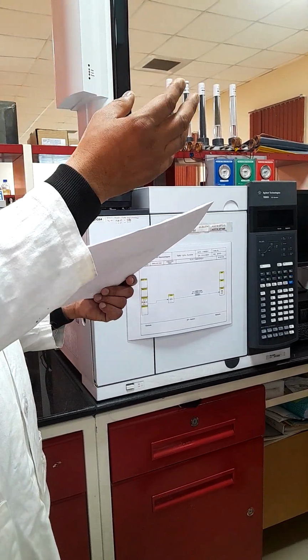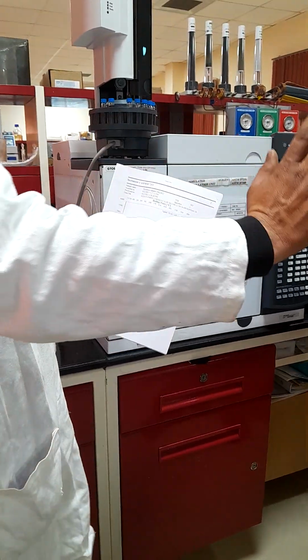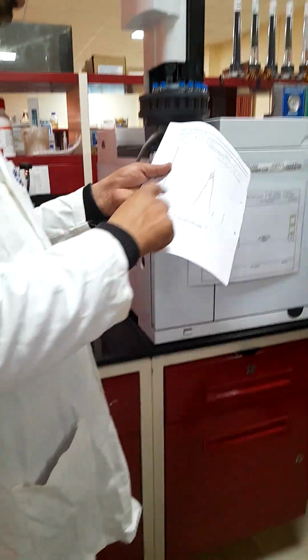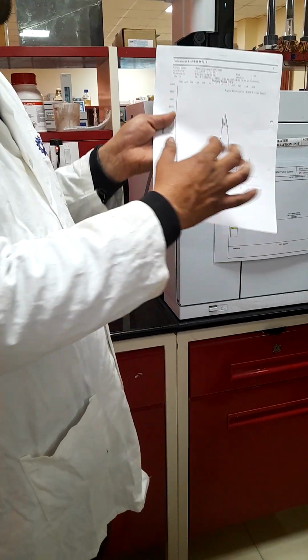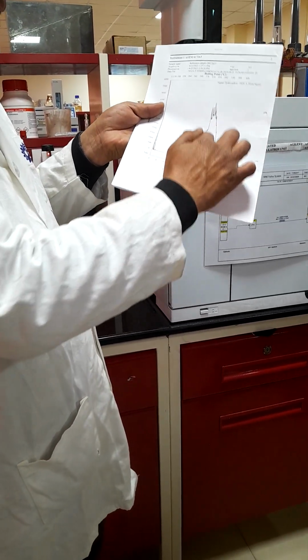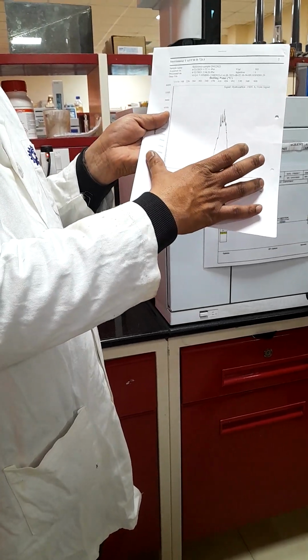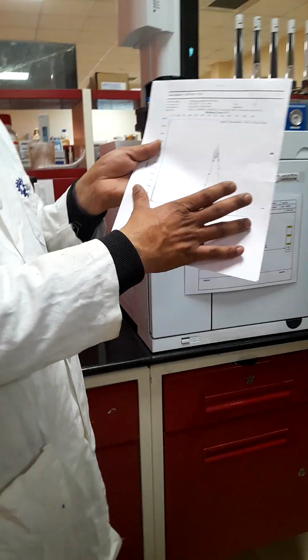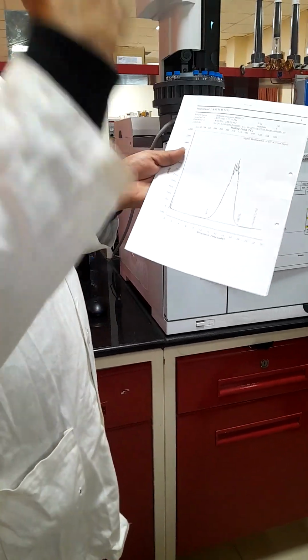So these are the 2 points noticed virtually there, but here it will run the whole chromatogram first, then decide how much area there is. There is a single peak. If it is multiple peaks, one peak is there, one peak is there, one peak is there, and then it will take the whole area of the chromatogram as 100%. And 0.5% is IBP and then FBP.